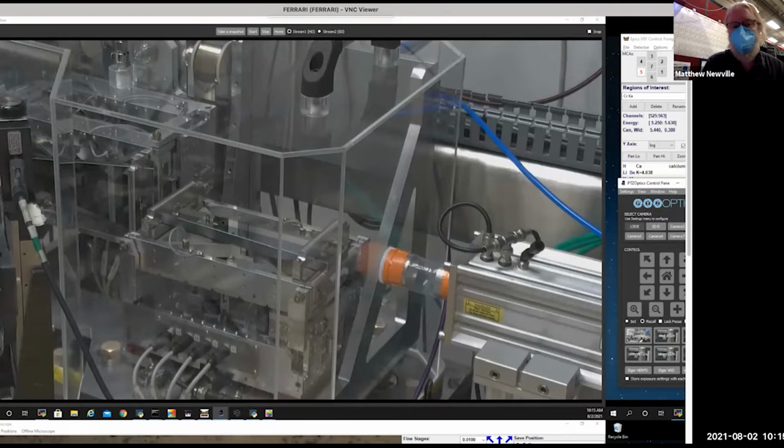You're trying to make an ellipse, it's not perfect. In fact, the amount by which that ellipse is not a perfect elliptical figure is the main limitation in how well we can focus this beam. And for the APS upgrade, which I think was discussed a little bit, we're going to have to work on how this mirror especially is figured, because over that 200 millimeters of 8 millimeter thick silicon, the gravitational sag of that mirror is important for limiting how well we can focus in the vertical.